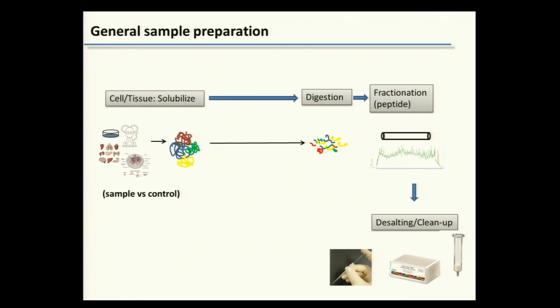Steve got at the sensitivity issue. In general, the proteins that you're interested in are going to have varying amounts within a very complex mixture that also has proteins in various amounts. So this is what we normally call the dynamic range problem. We have huge ranges of abundances in a very complex mixture, and we want to be able to sample them in the spectrometer as they're coming out from the HPLC.